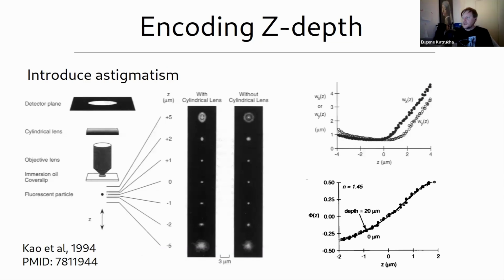The only problem was that at that point, the microscope was in warranty, and I was really excited to come and say, yeah, we're just going to unscrew the camera and put a cylindrical lens there. What could be the problem? But somehow there was not that much enthusiasm from Zeiss, and they were not really sure, maybe because of the alignment, so they didn't guarantee anything. They said, okay, let's try something different, maybe less destructive.